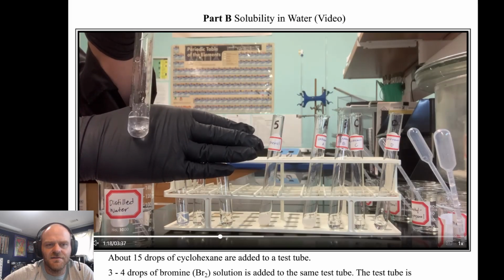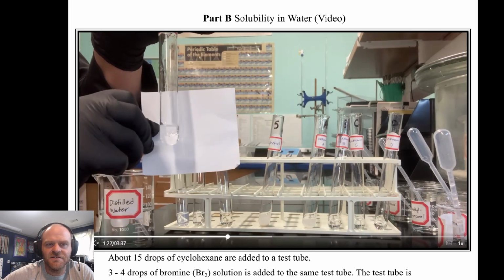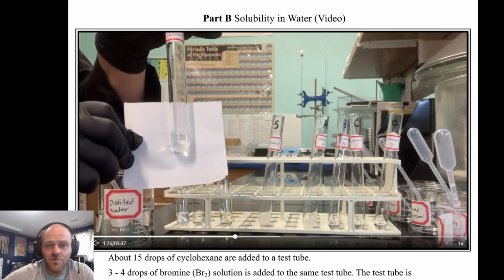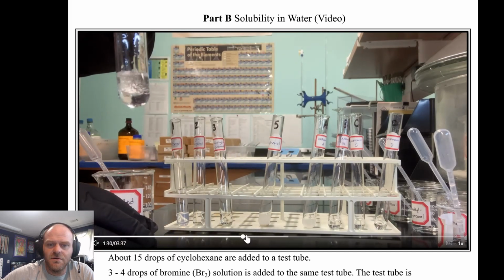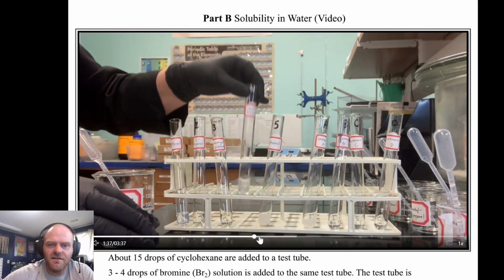Okay, so there is a clear delineation there, right? There's something different up top as there is on the bottom. So we call this one insoluble. She's making sure that you see that.